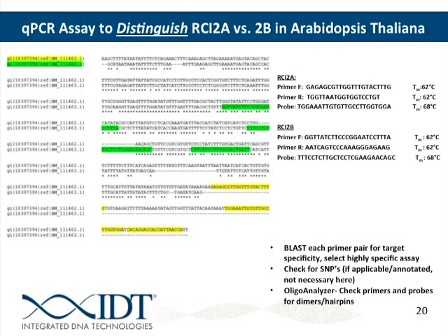By selecting Analyze, it gives you an overview of the sequence, the melting temperature, percent GC, and such. Can you just take a moment to show how the Tm changes when you encounter that? Oh, sure. Yep.